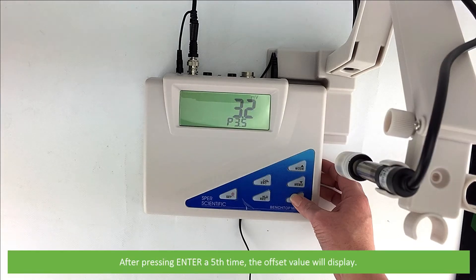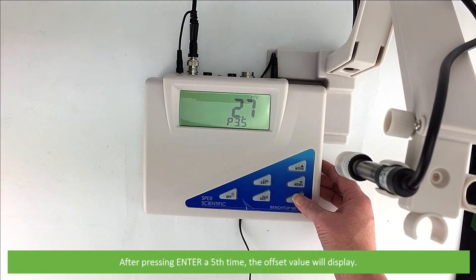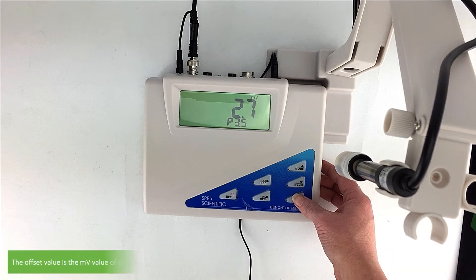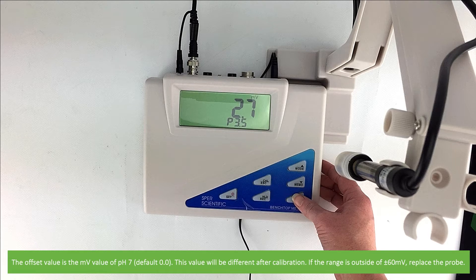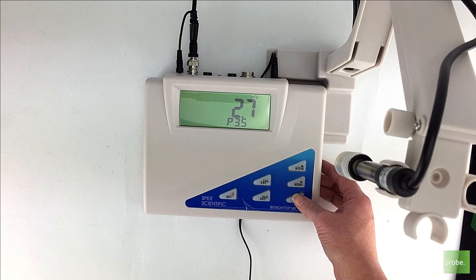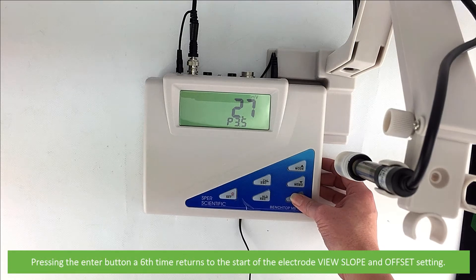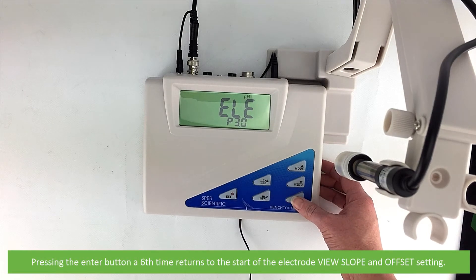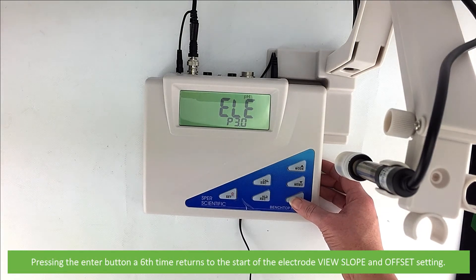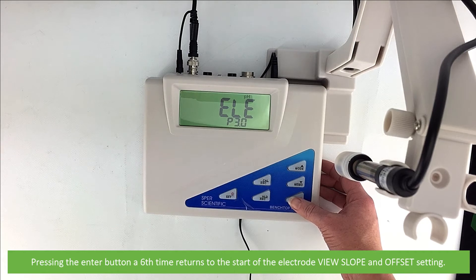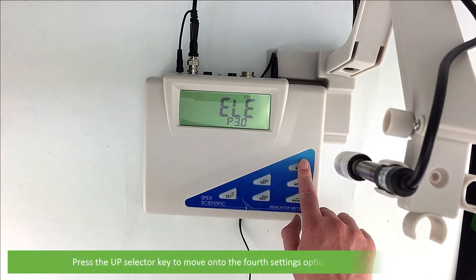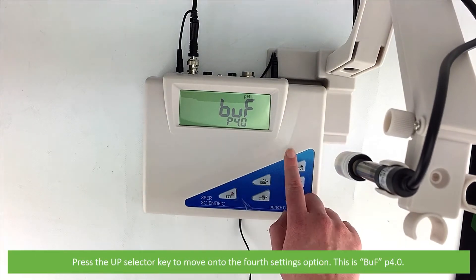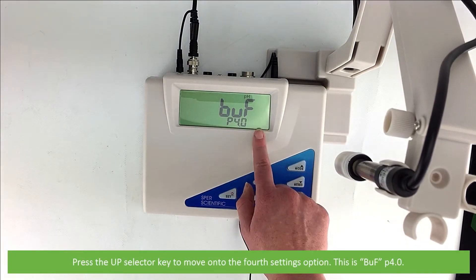After pressing enter a fifth time the offset value will display. The offset value is the millivolt value of pH 7. This value will be different after calibration. If the range is outside of plus or minus 60 millivolts replace the probe. Pressing the enter button a sixth time returns to the start of the electrode view slope and offset setting. Press the up selector key to move on to the fourth setting option.